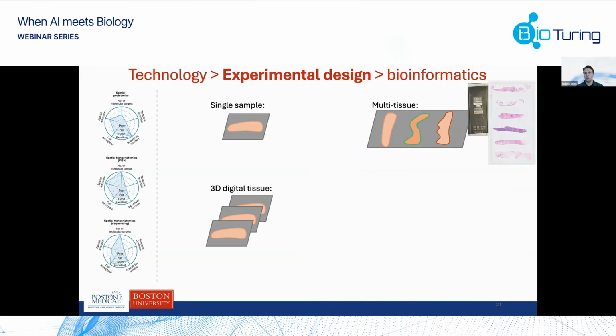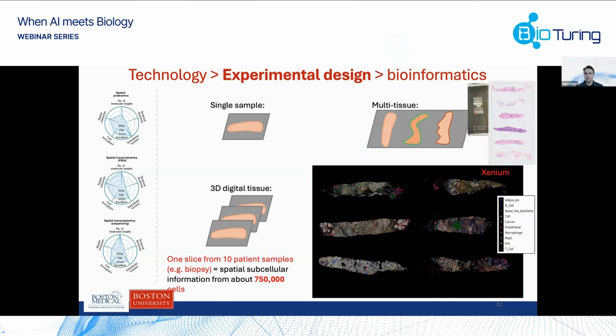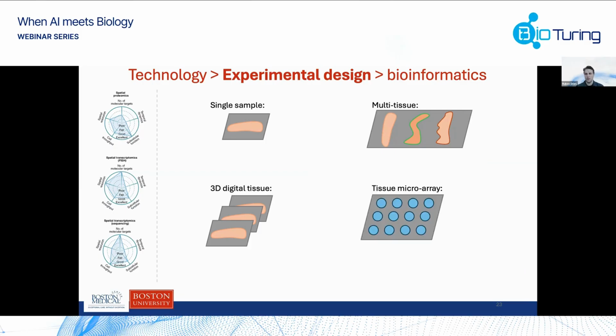With some of the newer technologies like Xenium, it's very easy to multiplex a lot of tissues. So we're also seeing really big data sets with multiple samples from multiple patients or multiple mice, anything you can think of. This is just an example of something we do. We're generating really large breast cancer data sets using the Xenium platform to see if some of the clinical assays that are being used right now still hold true if you look at them from a spatial lens.